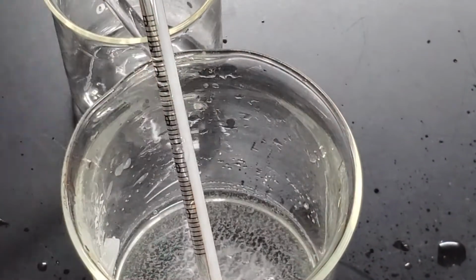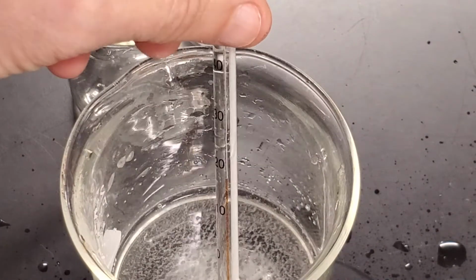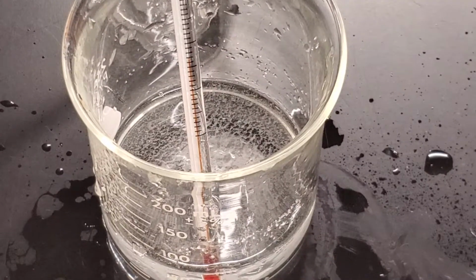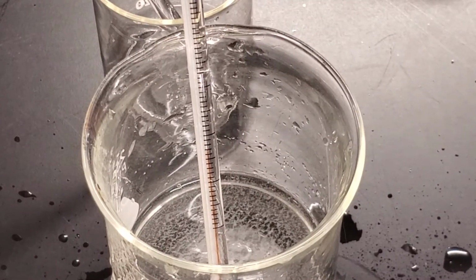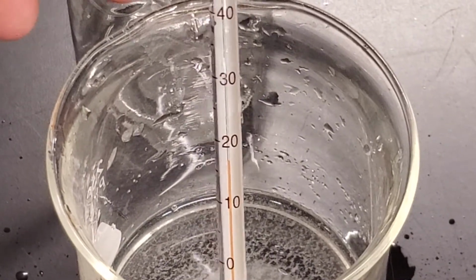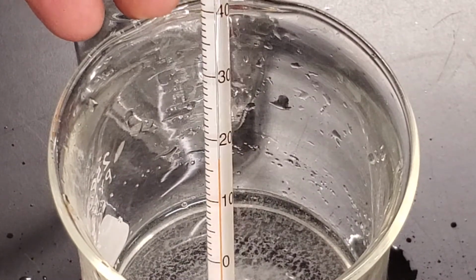Now let's check out what the temperature is doing. We've done at least a minute in there. Scoot this back and zoom it in a little bit, maybe be a little easier to read that temperature. All right, so there's our 20-degree line.